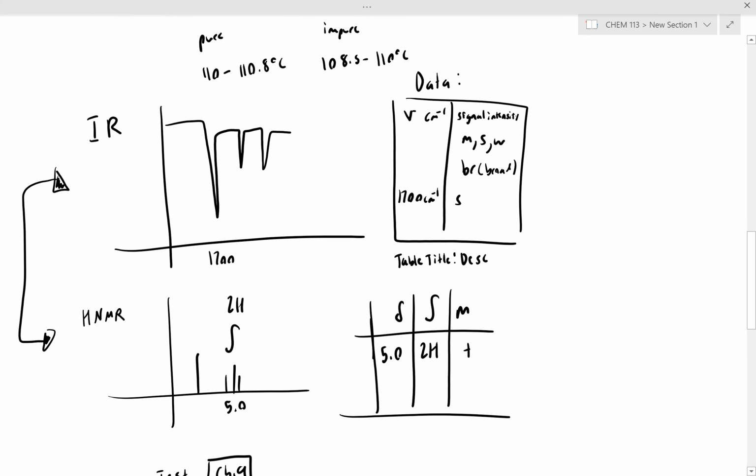They're not so much useful in terms of determining the percent purity. You typically have to get detailed integrations for your impurity peaks and have an idea of what your impurities are in order to use NMR to calculate the relative purity of your sample.